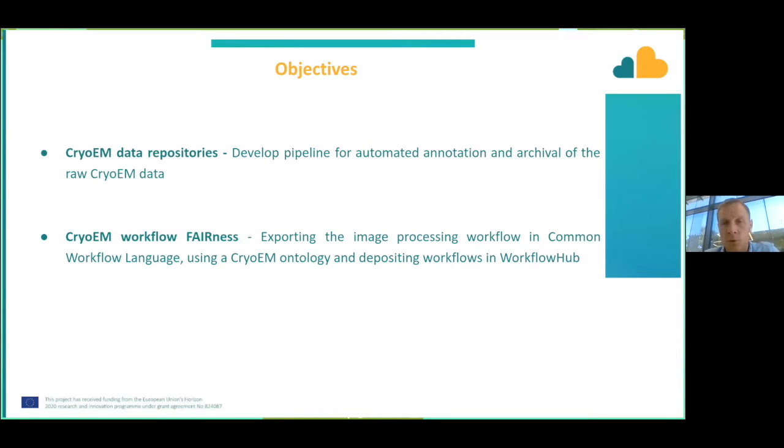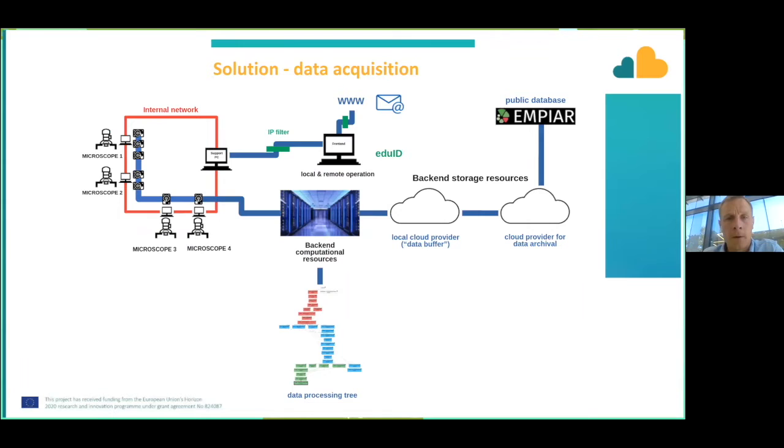Together with that, we also want to export the image processing workflows in a common workflow language using the cryo-EM ontology, and have a chance to deposit those workflows in the Workflow Hub. So, starting with the pipeline for the cryo-EM data deposition.